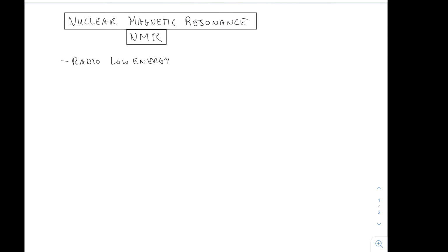One of the interesting things about nuclear magnetic resonance is that the same technology is used in the organic chemistry lab as it is for MRI, except I believe we really just take away the nuclear portion for the magnetic resonance imaging. We take away nuclear because nuclear kind of sounds scary, right? Like a nuclear explosion. And so although they are the same, we call it magnetic resonance imaging for medical purposes, and then in the organic chemistry lab, for example, we call it nuclear magnetic resonance.